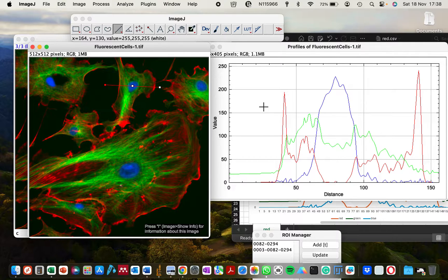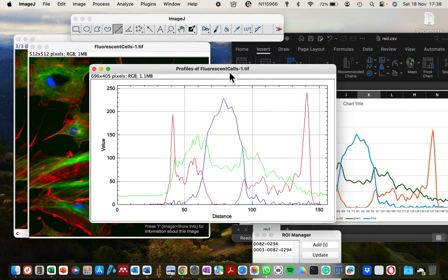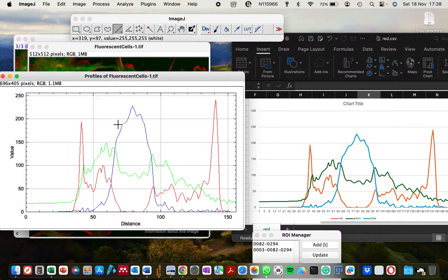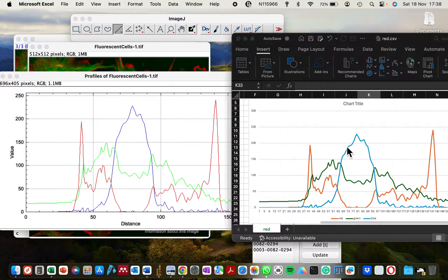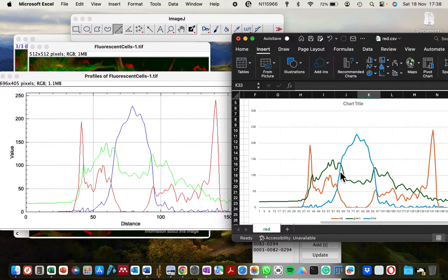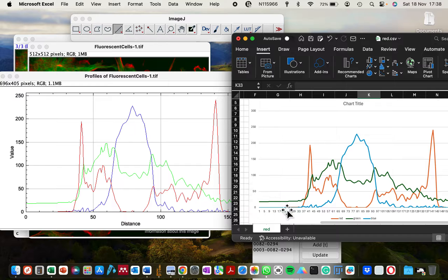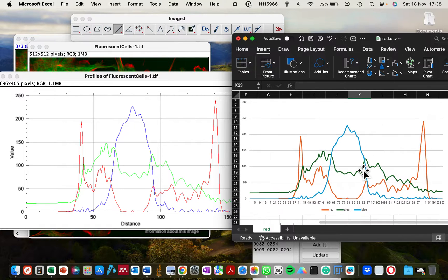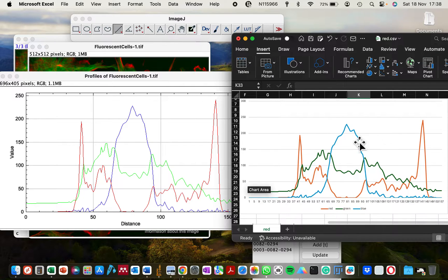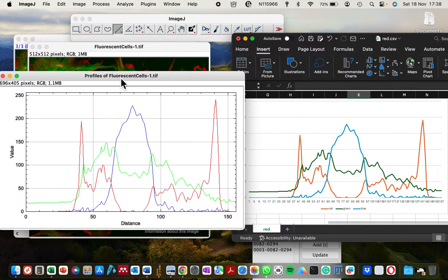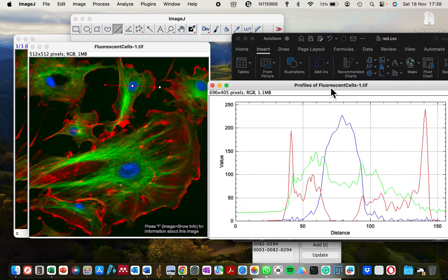So what I'm going to show you is how to achieve the same purpose and be able to export the data to Excel and then make your plot. You can see that I've been able to regenerate the same plots in an Excel document.